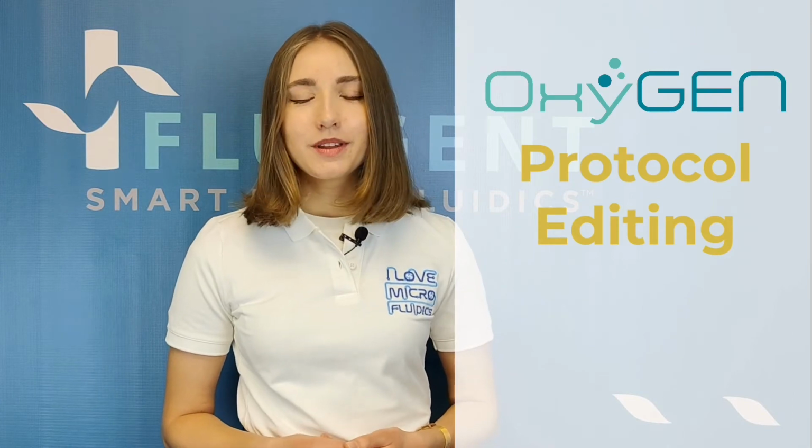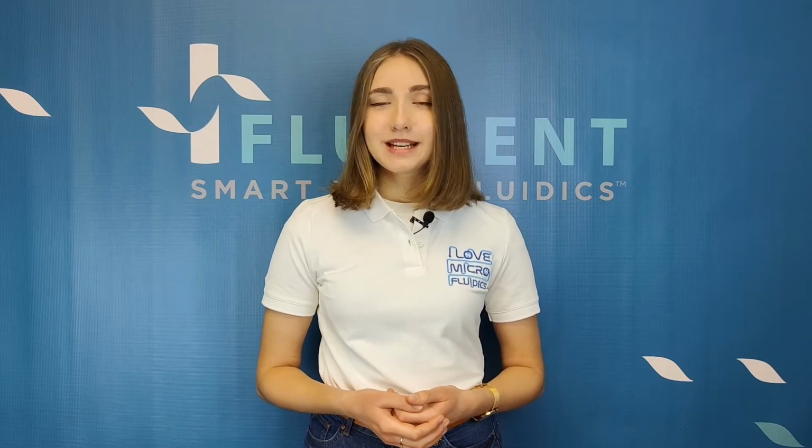And welcome to another OxyGEN tutorial. In this video, we'll show you how you can run and edit a simple protocol with our software. Automating an experiment has never been that easy.